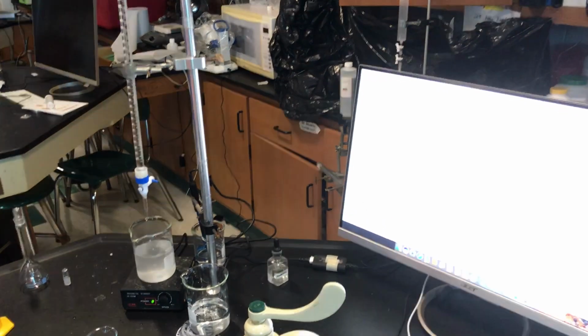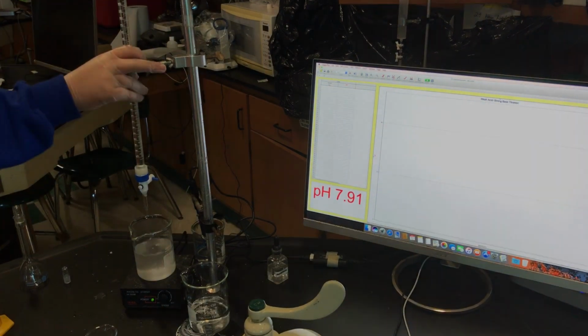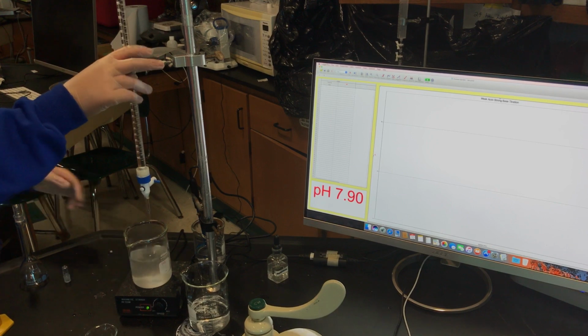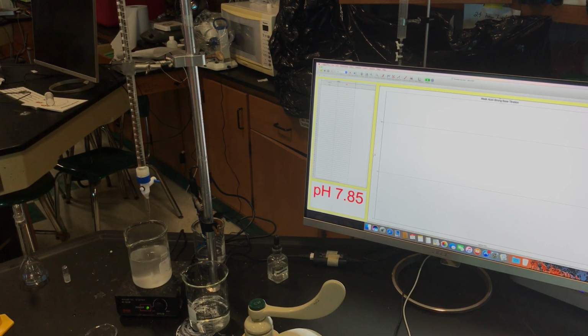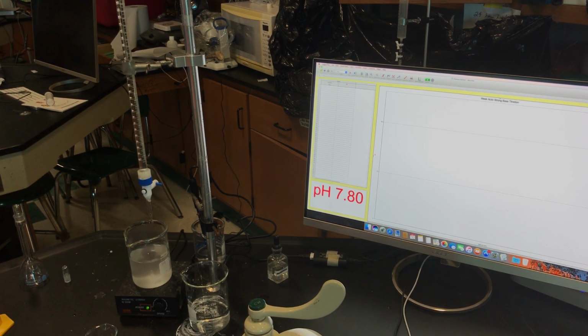All right, so what we're going to do now is put that pH probe in the solution that we're testing. So I'll help you with that. Okay, so you're all set up here.